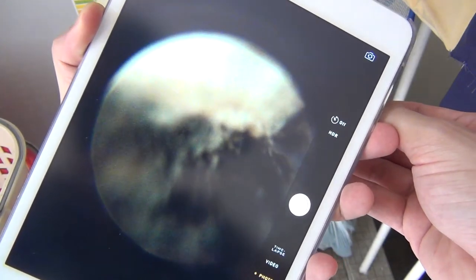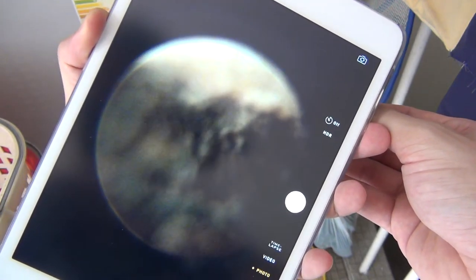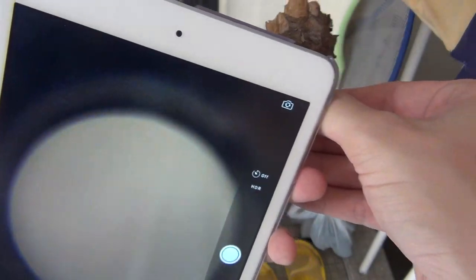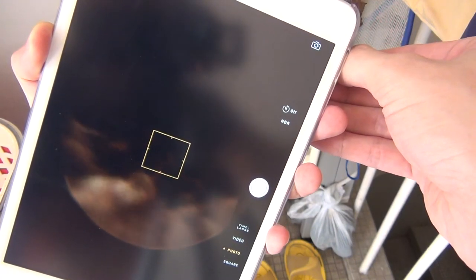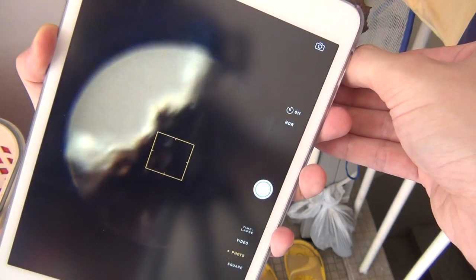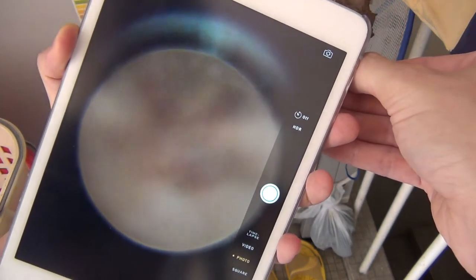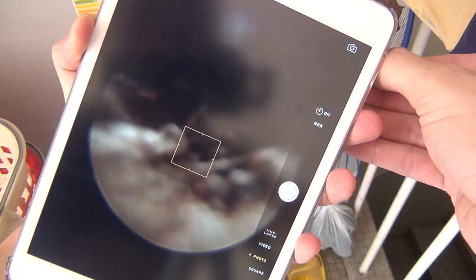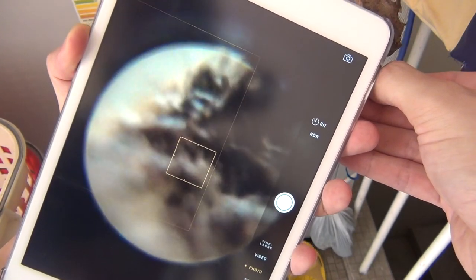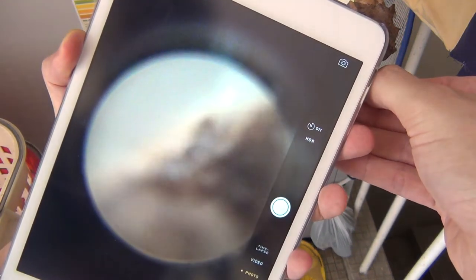The best way, if you're going to use two lenses like this, is to have a light source shining from the side so that some light can just penetrate from the side of the lens. You kind of see the structure of the paper wasp nest — that's how they make this papery stuff.